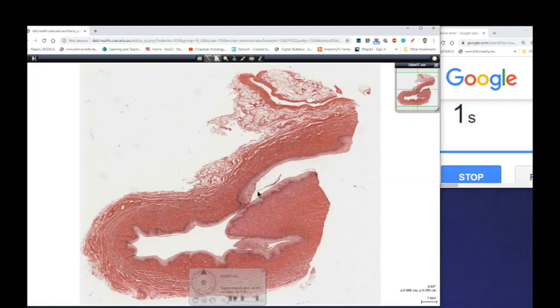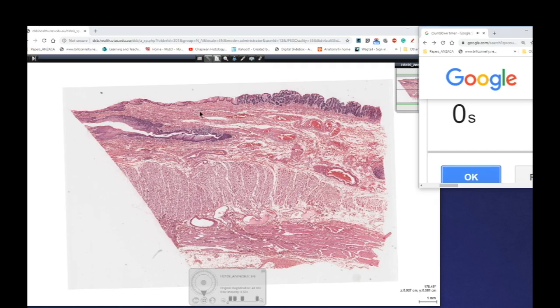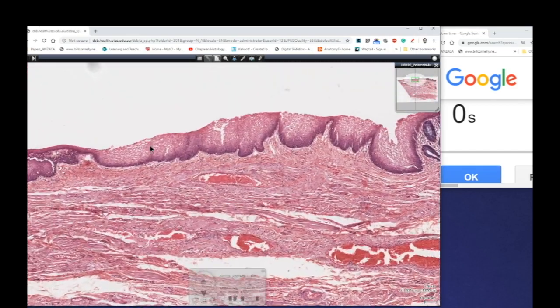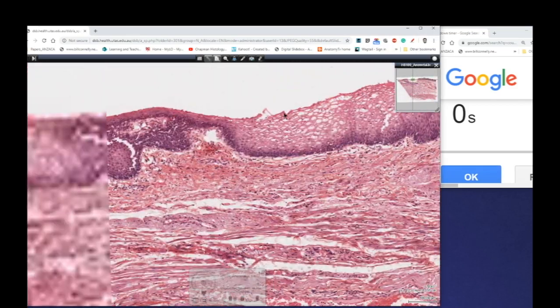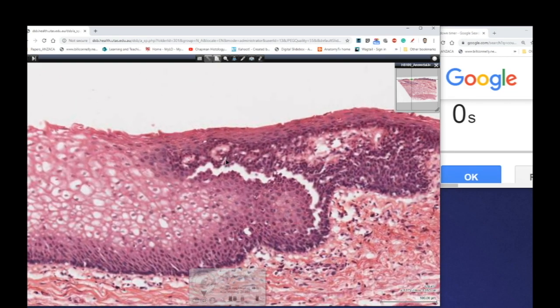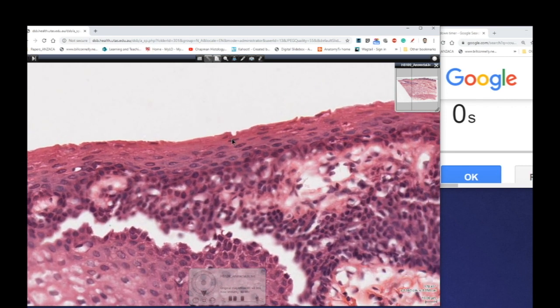Lastly, we can look at the anal-rectal junction. Over here is the anal canal — again we've got our stratified squamous thick epithelium, with a little artifact disruption there. But if we zoom in we can actually see these flattened nuclei of our squamous cells all the way to the surface.